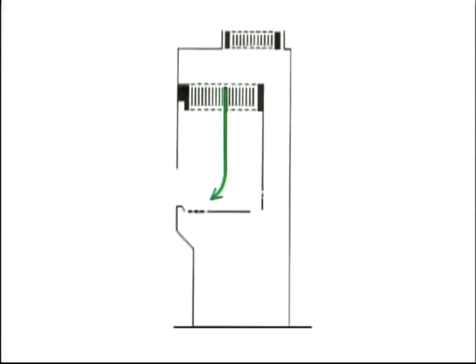The air flowing toward the front of the cabinet is prevented from carrying contaminants out of the cabinet when it combines with the makeup air flowing in through the front opening to replace air exhausted through the exhaust HEPA filter at the top of the cabinet.